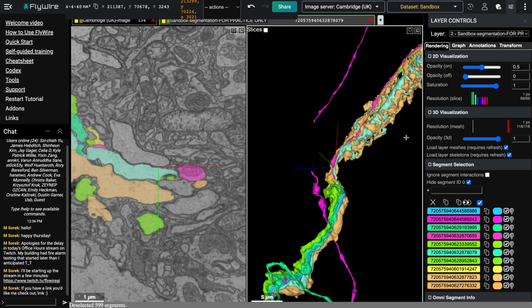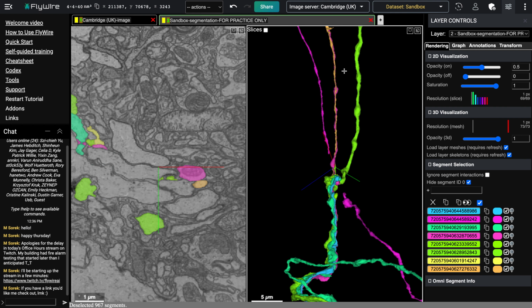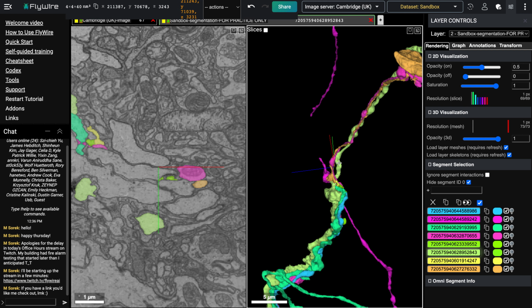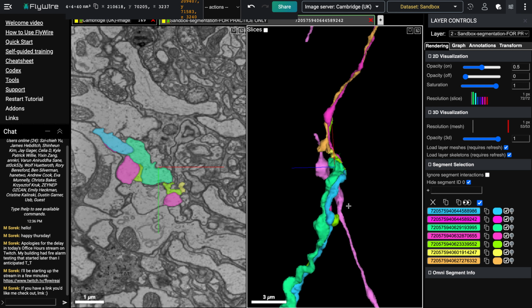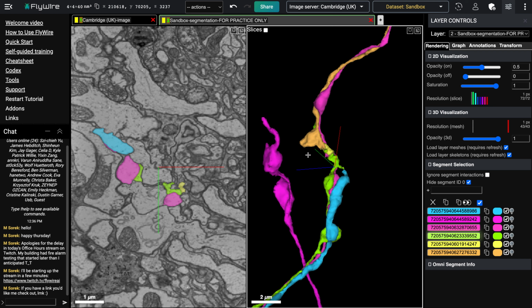The structure I know is not similar with this one or this one. Alright, so I've gotten rid of those. This one doesn't look like it's it. Let's go back down here a little bit. Let's get rid of this green structure.